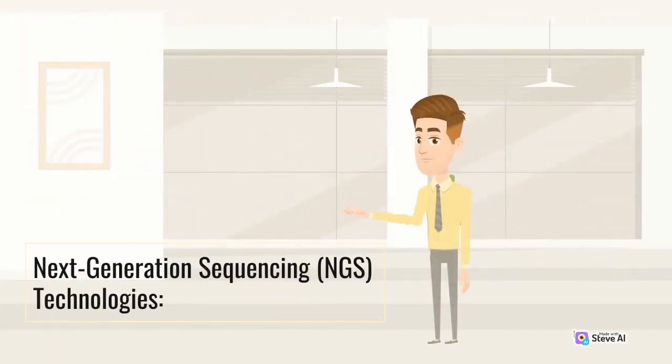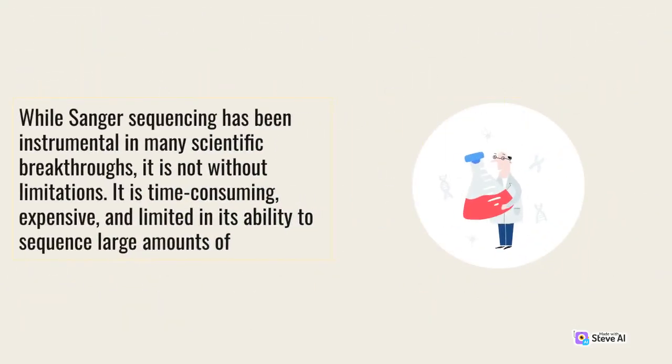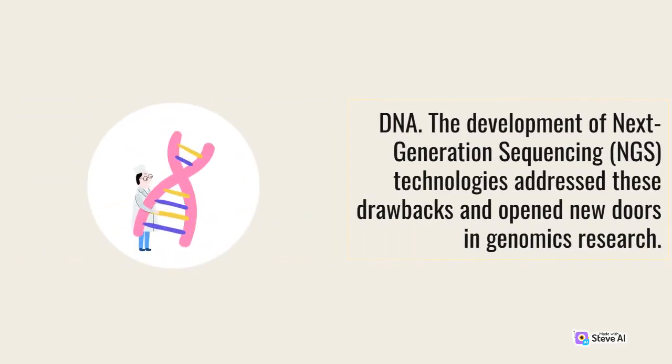Next-generation sequencing, NGS, technologies. While Sanger sequencing has been instrumental in many scientific breakthroughs, it is not without limitations. It is time-consuming, expensive, and limited in its ability to sequence large amounts of DNA. The development of next-generation sequencing, NGS, technologies addresses these drawbacks and opens new doors in genomics research.